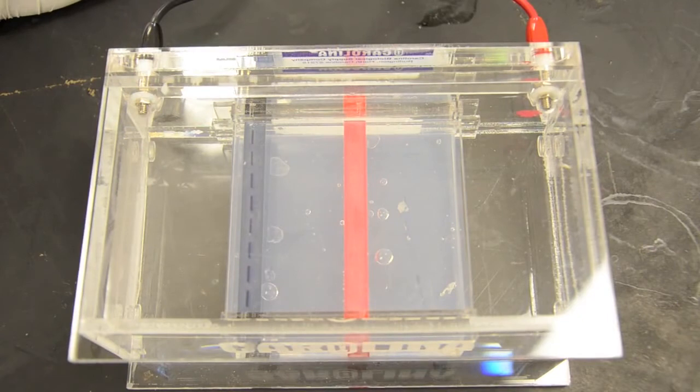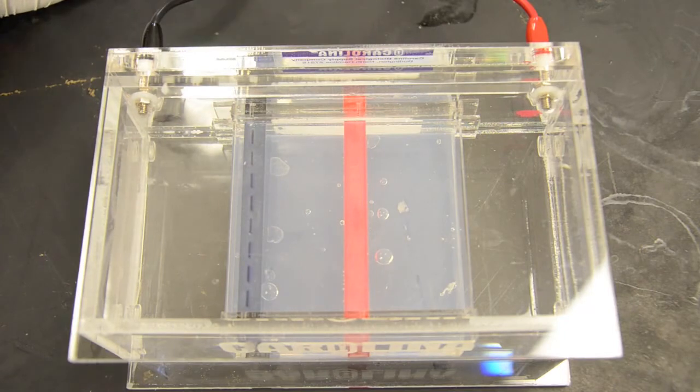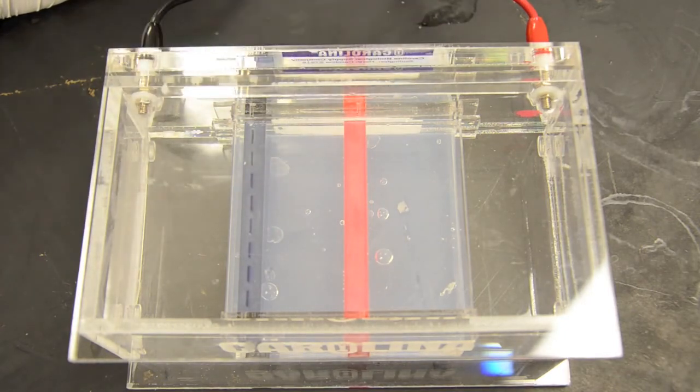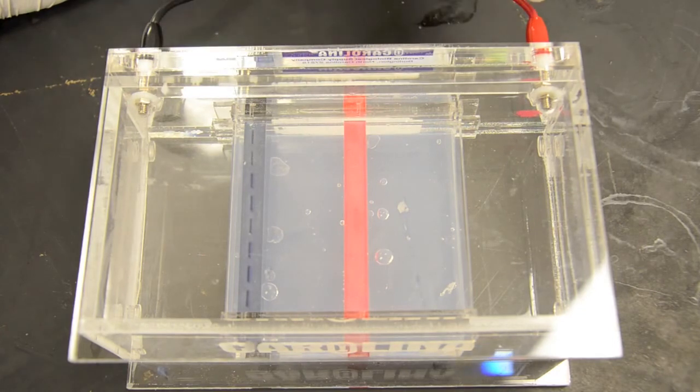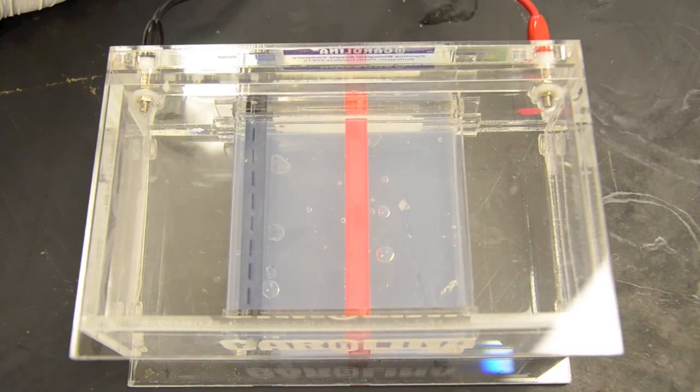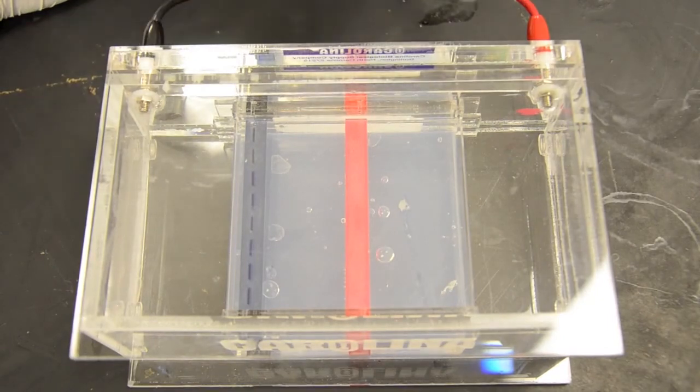Okay, so we have the current flowing going from a negative charge to a positive charge. Now DNA is negatively charged so in order to get the DNA to actually run down the well to where we can get an accurate reading we're going to need it to go down to the positive charge and that's exactly what you're about to see here, is the DNA going from the negative to the positive charge.